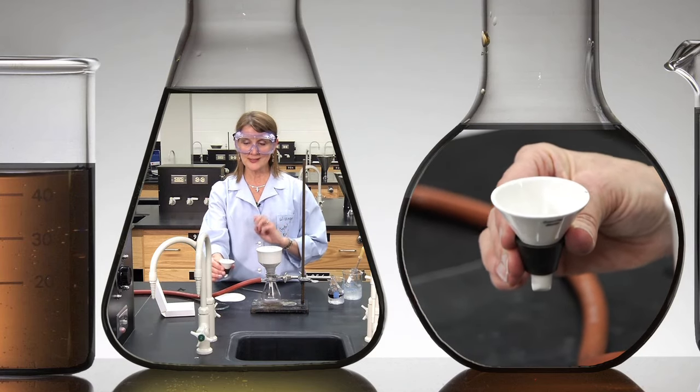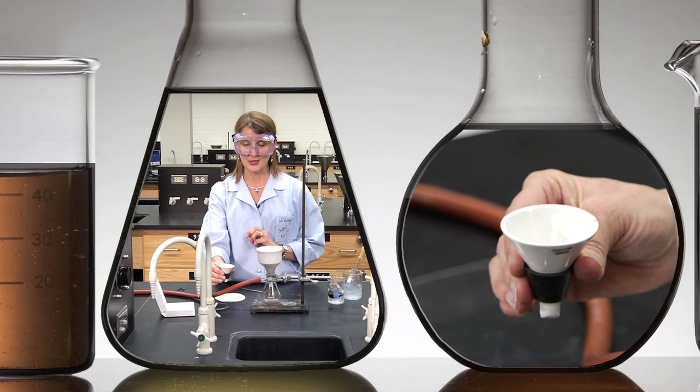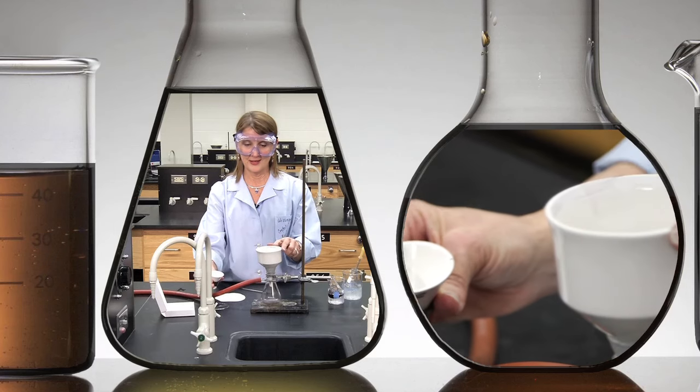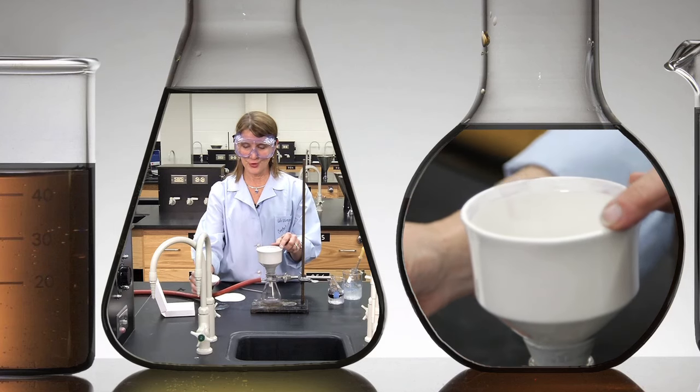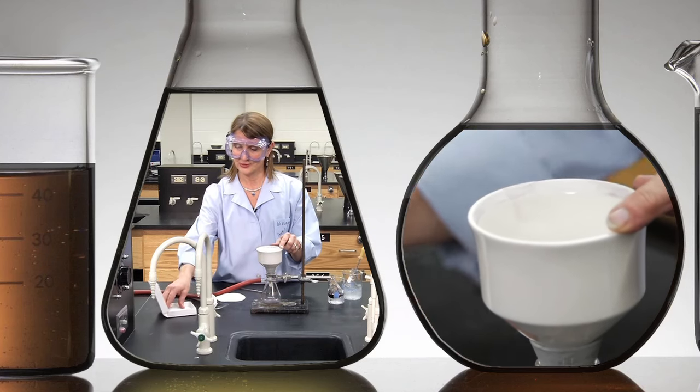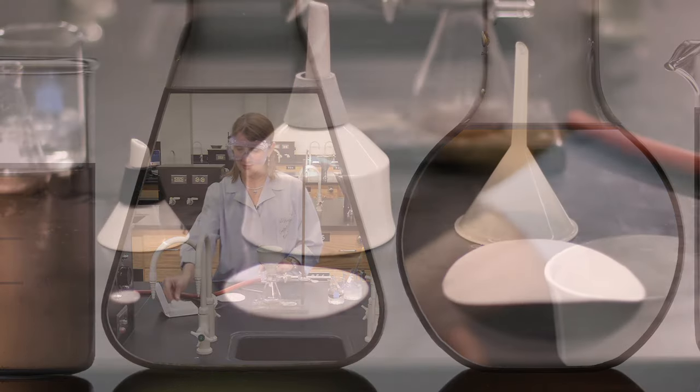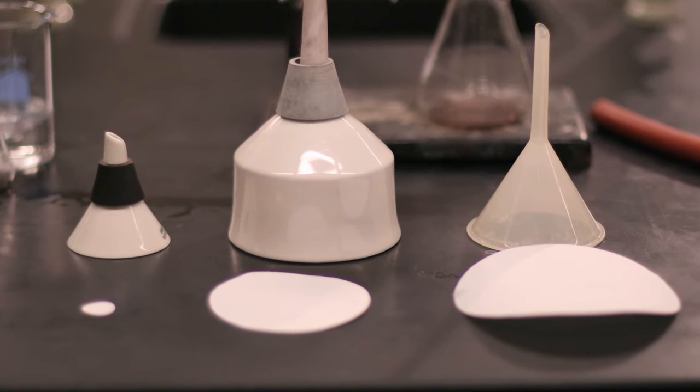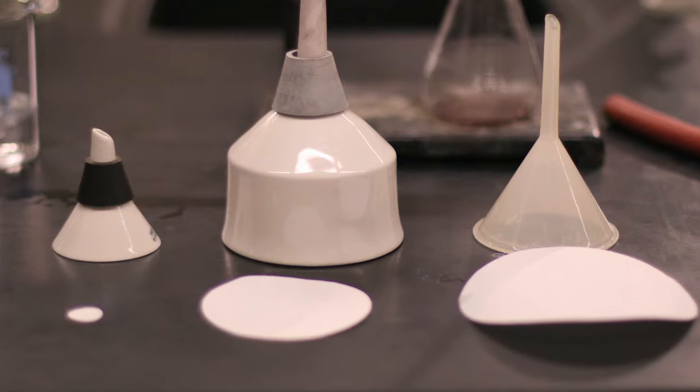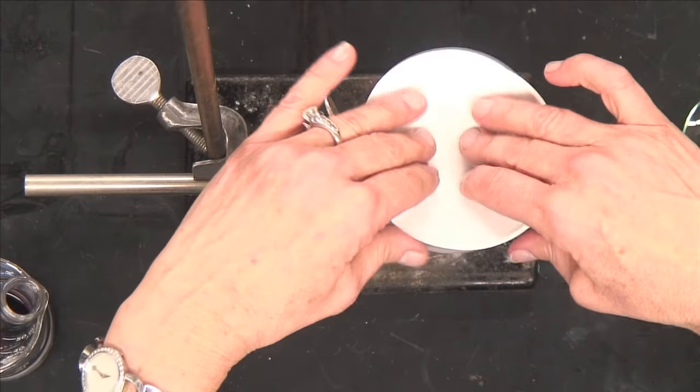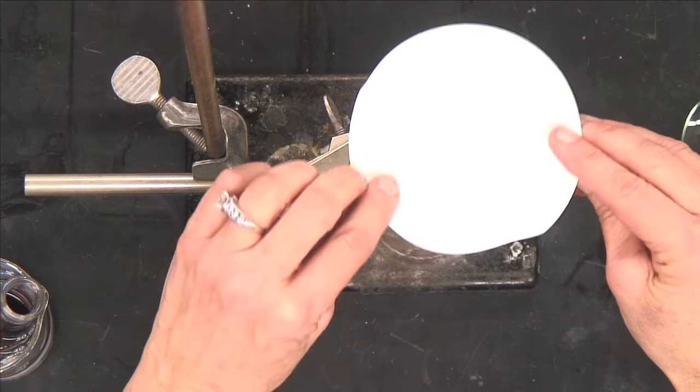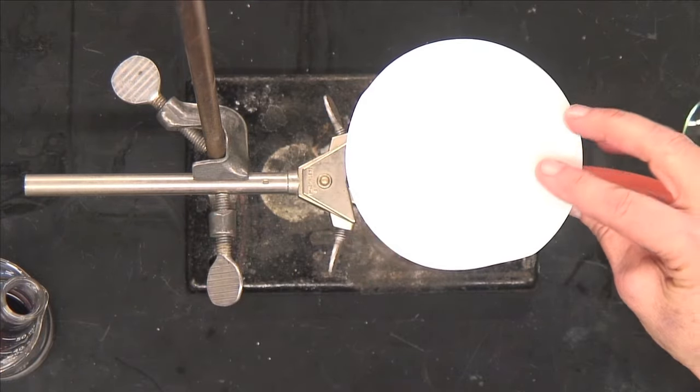So there's three types of filter papers found in our laboratory. The small one for the Hirsch funnel. The next size larger for the Buchner funnel, and then the filter papers that are larger that we use for gravity filtration. You do not want to try to stuff the gravity filter paper into the Buchner funnel as this would not be a good vacuum filtration.